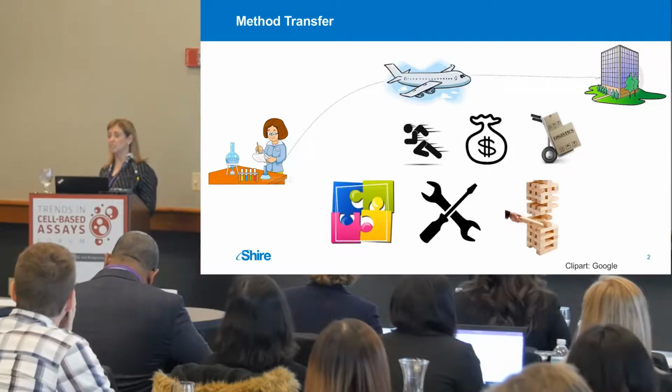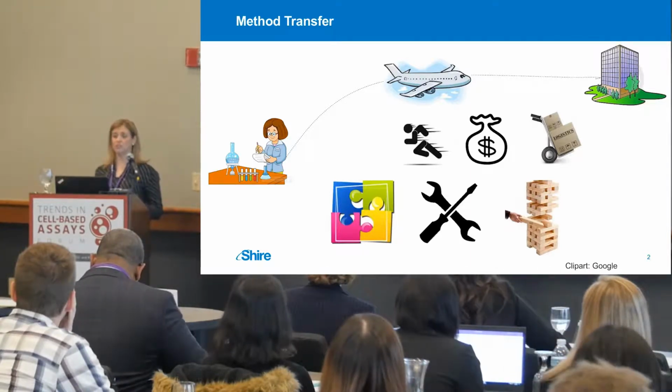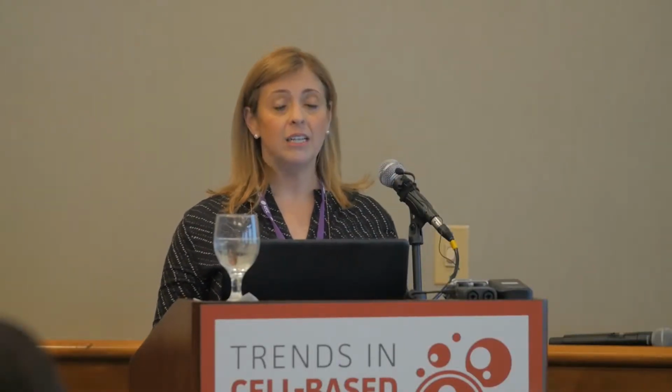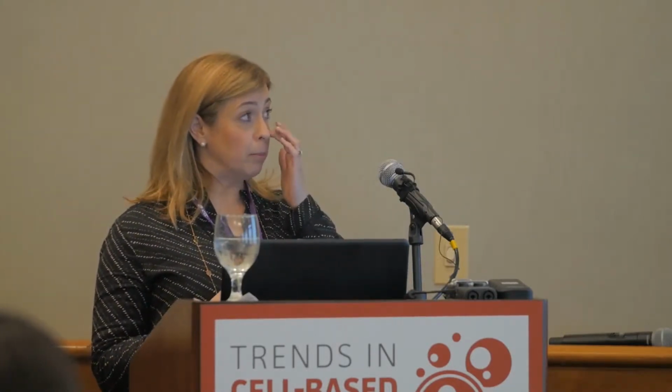You could be insourced, even insourcing method transfers, as you know, and it serves a lot of different functions. It can give you increased testing capability and capacity. It can sometimes give you speed if you're set up properly. It can also be an important part of commercialization. So that's an exciting part, when you get to that stage.